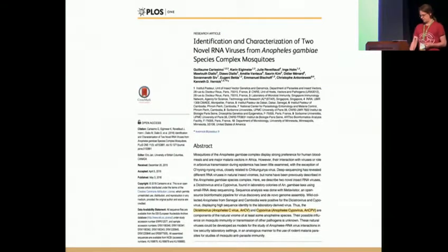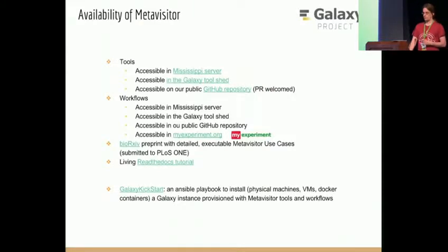And this is a collaboration that we had been doing on the assembly and the development of the workflow, and the guys there had been using that on Anopheles gambiae, and using this, they were actually able to confirm 2 new viruses in their samples. So the complete workflow, the complete suite is available. We took good care that this is completely accessible and reproducible, and that people can confirm it or use it with their own data.